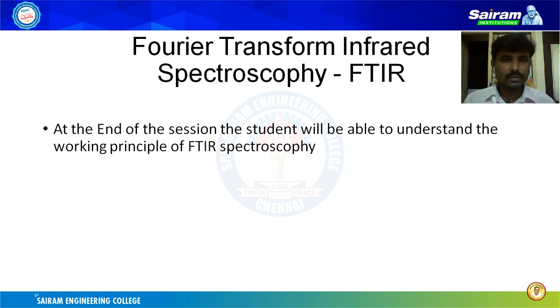Hi friends, good morning. Today we are going to see about an interesting topic called Fourier transform infrared spectroscopy. In short form we can call it FTIR.